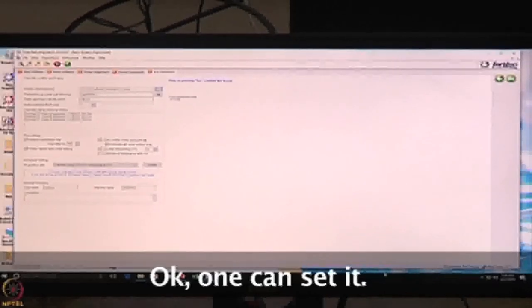Temperature, we are at 23 degrees. We are working at room temperature now. This instrument can work from 15 degrees to 40 degrees. You can set it and allow for stabilization. It has a Peltier.